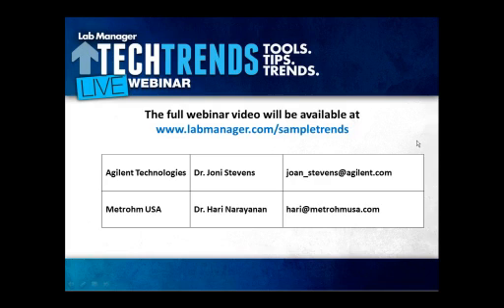Well, in the case of either the just enough technique or something more like solid phase extraction, I think it's very important, when a method has been validated, to have a written SOP that can easily be transferred within a lab and between labs. If you choose to do something manually, documenting everything is very important, because different techniques between people can be hard to identify if it's not documented.